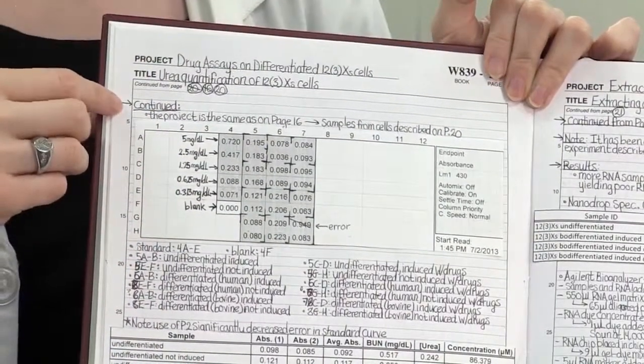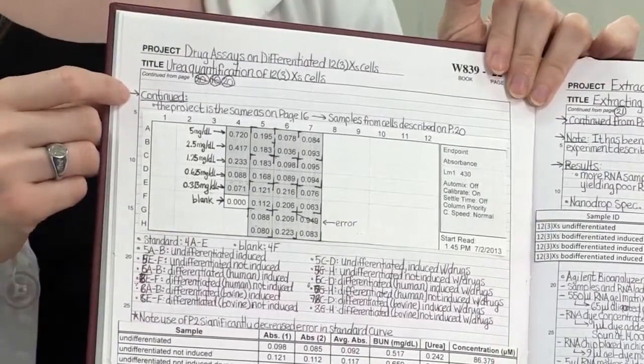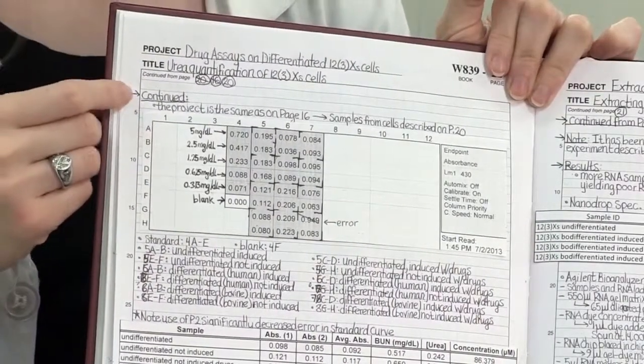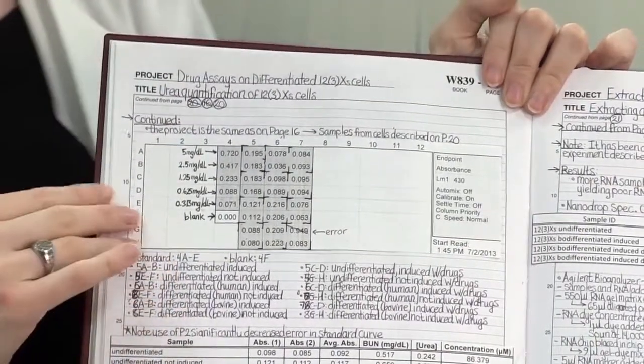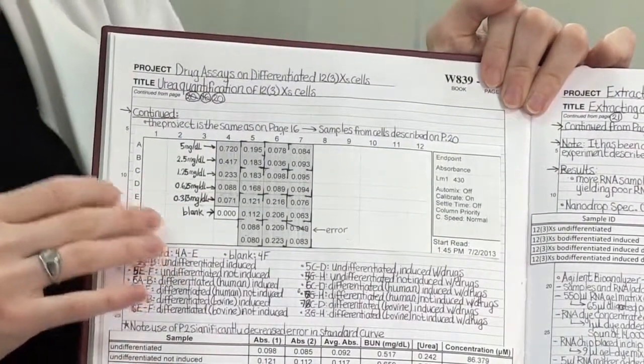It's also really important to write a quick sentence about why you're doing this experiment, what your objective is. That helps keep your eye on the prize and helps you remember why you're doing it.